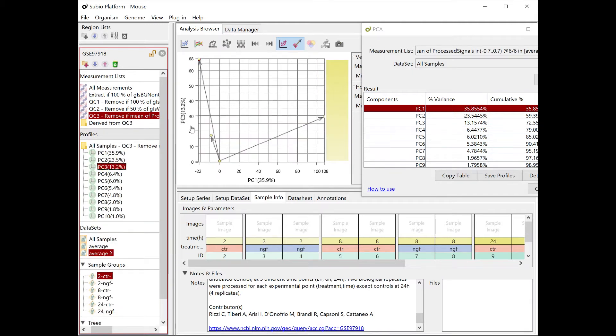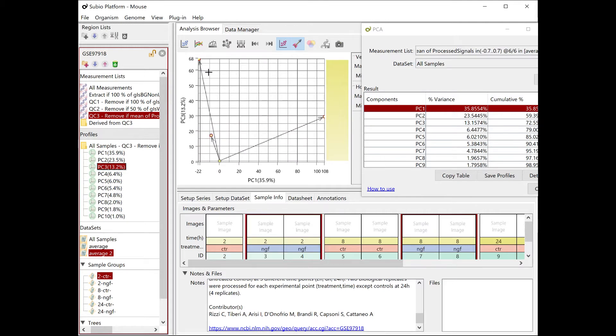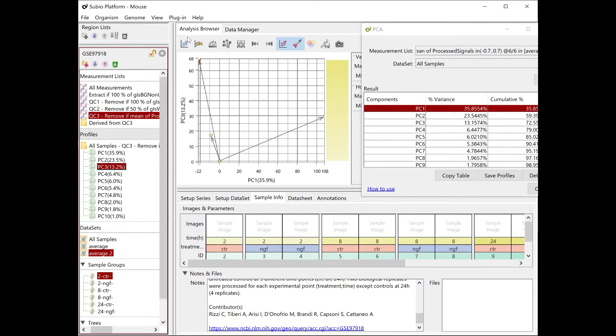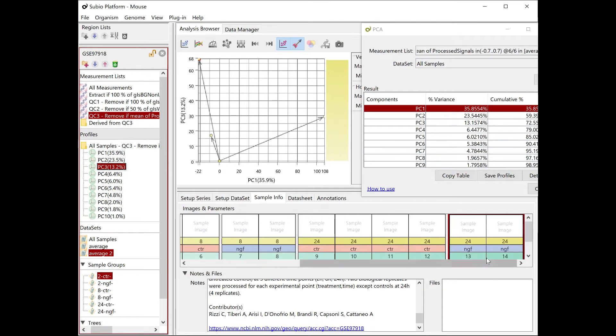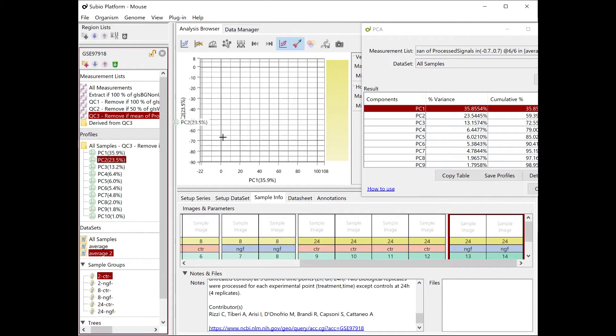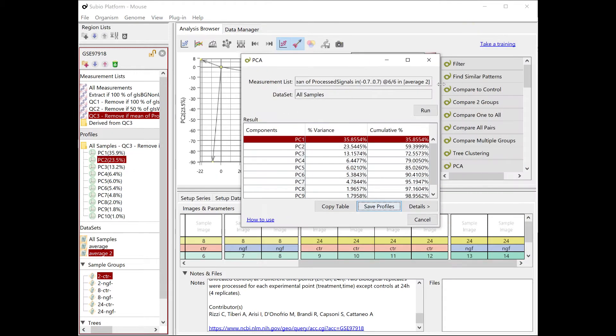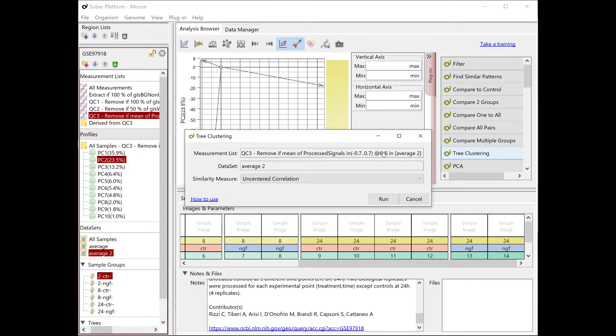Assigning the third principal component to the vertical axis reveals that the twenty-four hour samples contribute to it. In summary, the PC1 is characterized by the two-hour samples, PC2 by the eight-hour, and PC3 by the twenty-four hour samples, respectively.